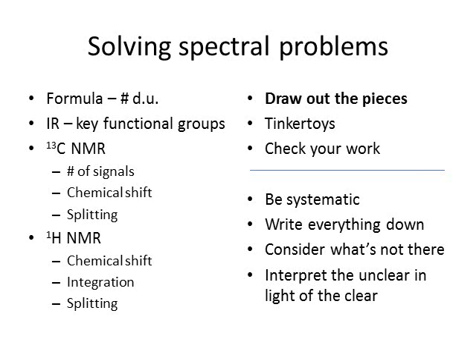One thing to keep in mind is if there's a very large number of degrees of unsaturation, that would be consistent with a benzene ring or something like a benzene ring. Doesn't prove it, but when I have 4 or more degrees of unsaturation, I think to myself that there is quite likely an aromatic ring, or a benzene ring, sorry. Benzene is an aromatic compound. We will learn more about those in a subsequent chapter.